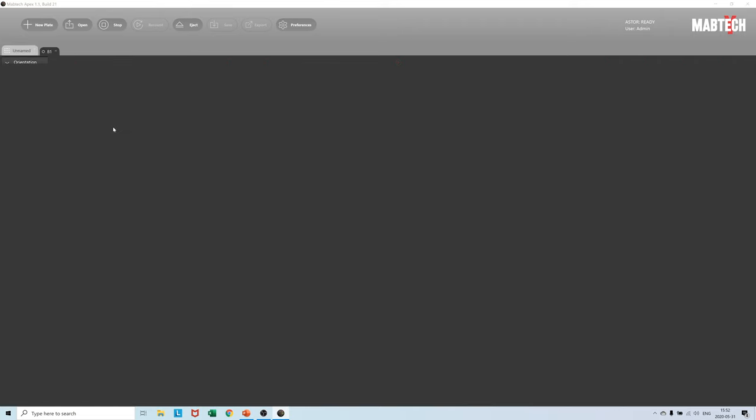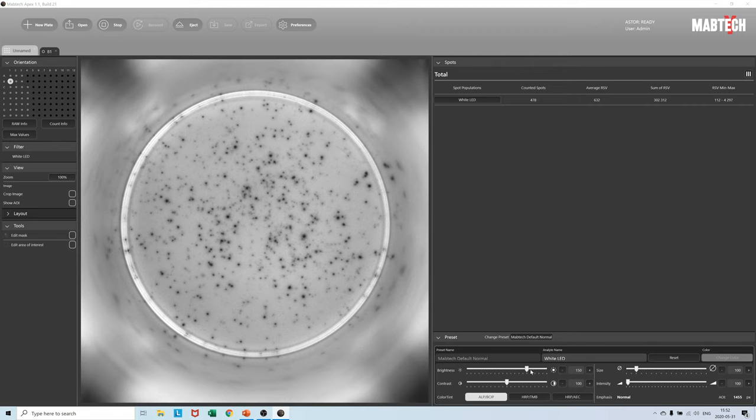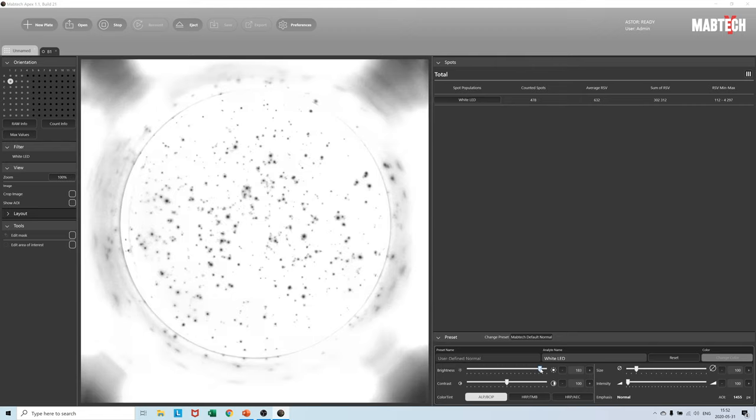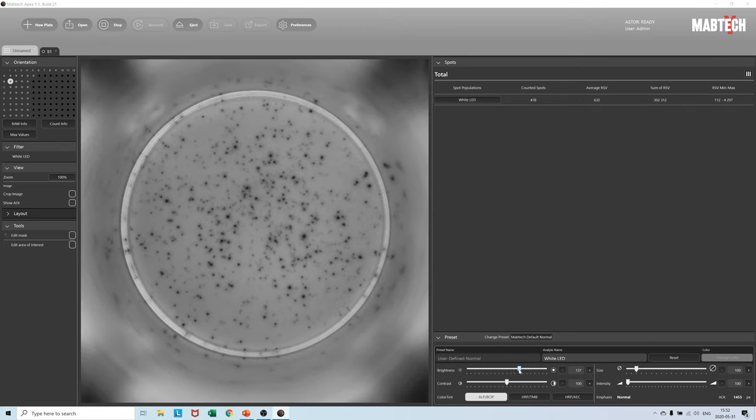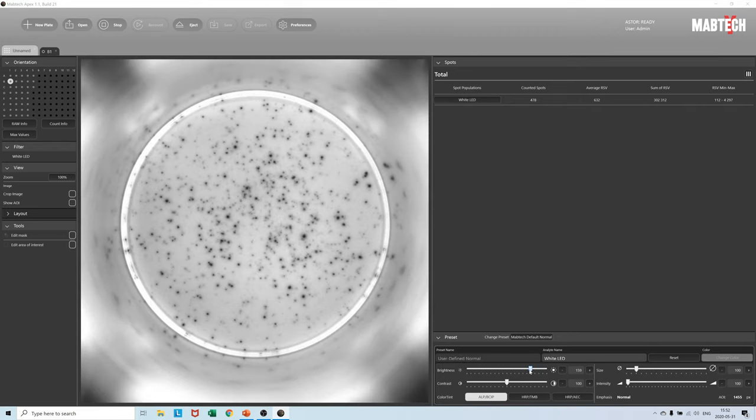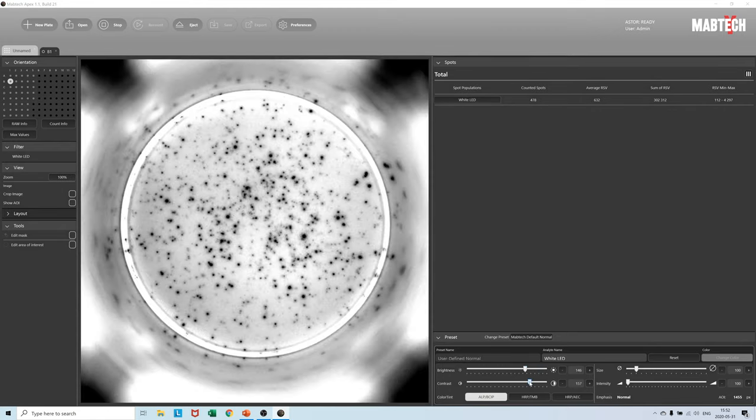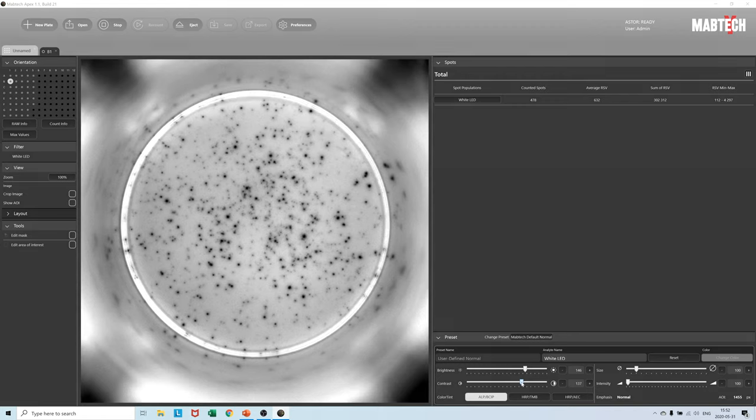The Rawspot algorithm that counts the spots works in the image raw domain. We don't have to fiddle with any sort of camera settings. Everything of that sort of nature is done in post-processing.